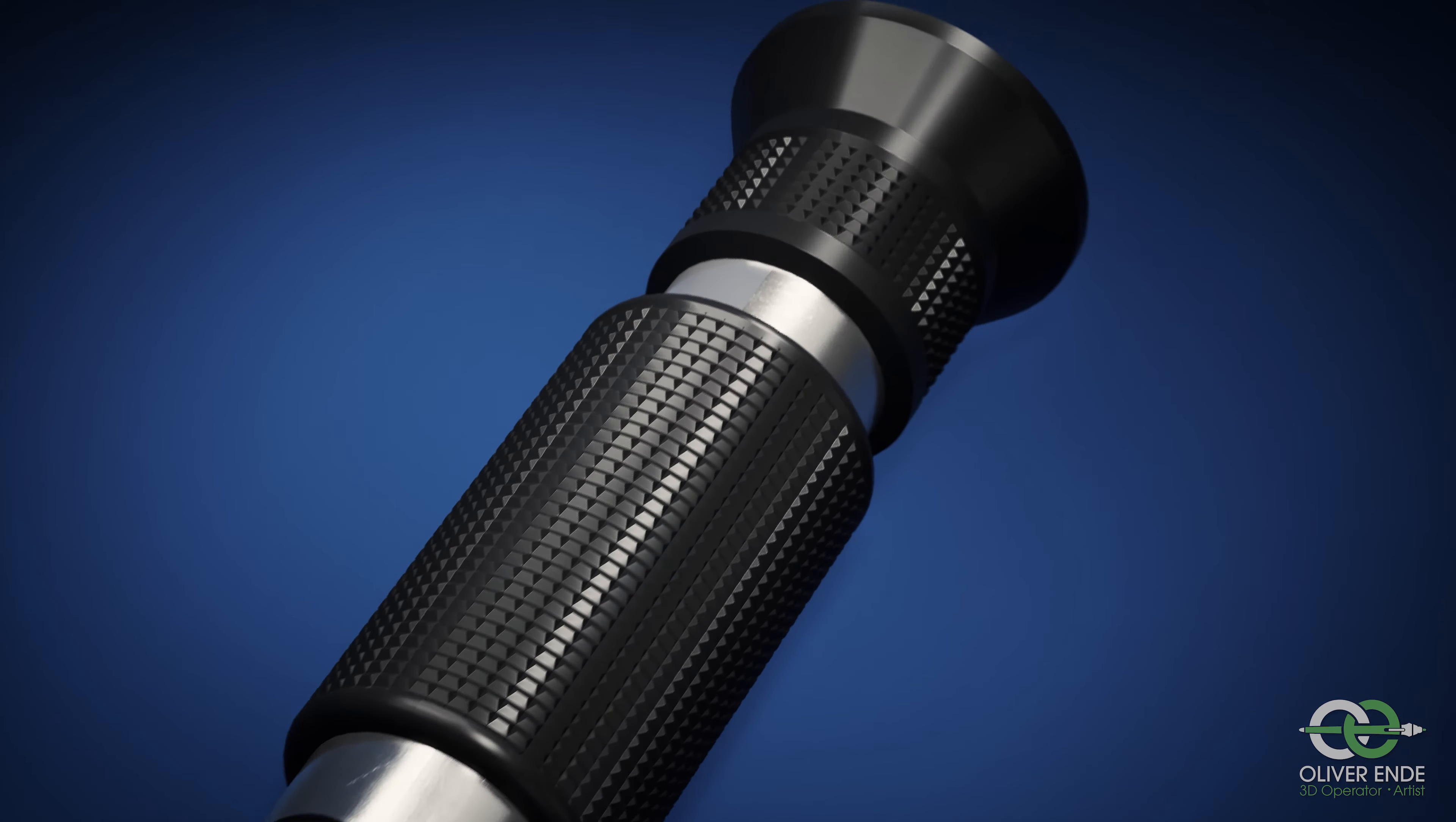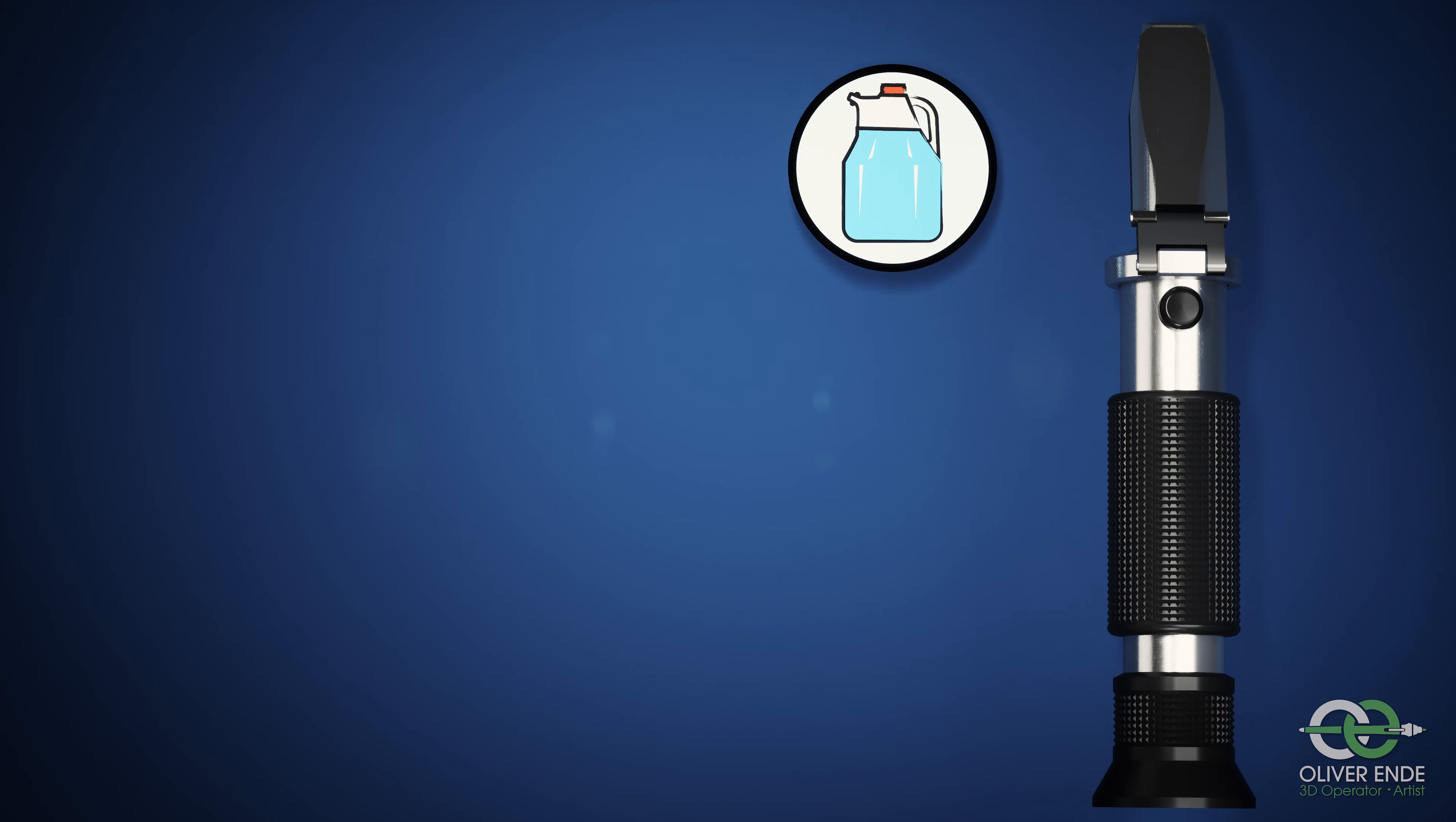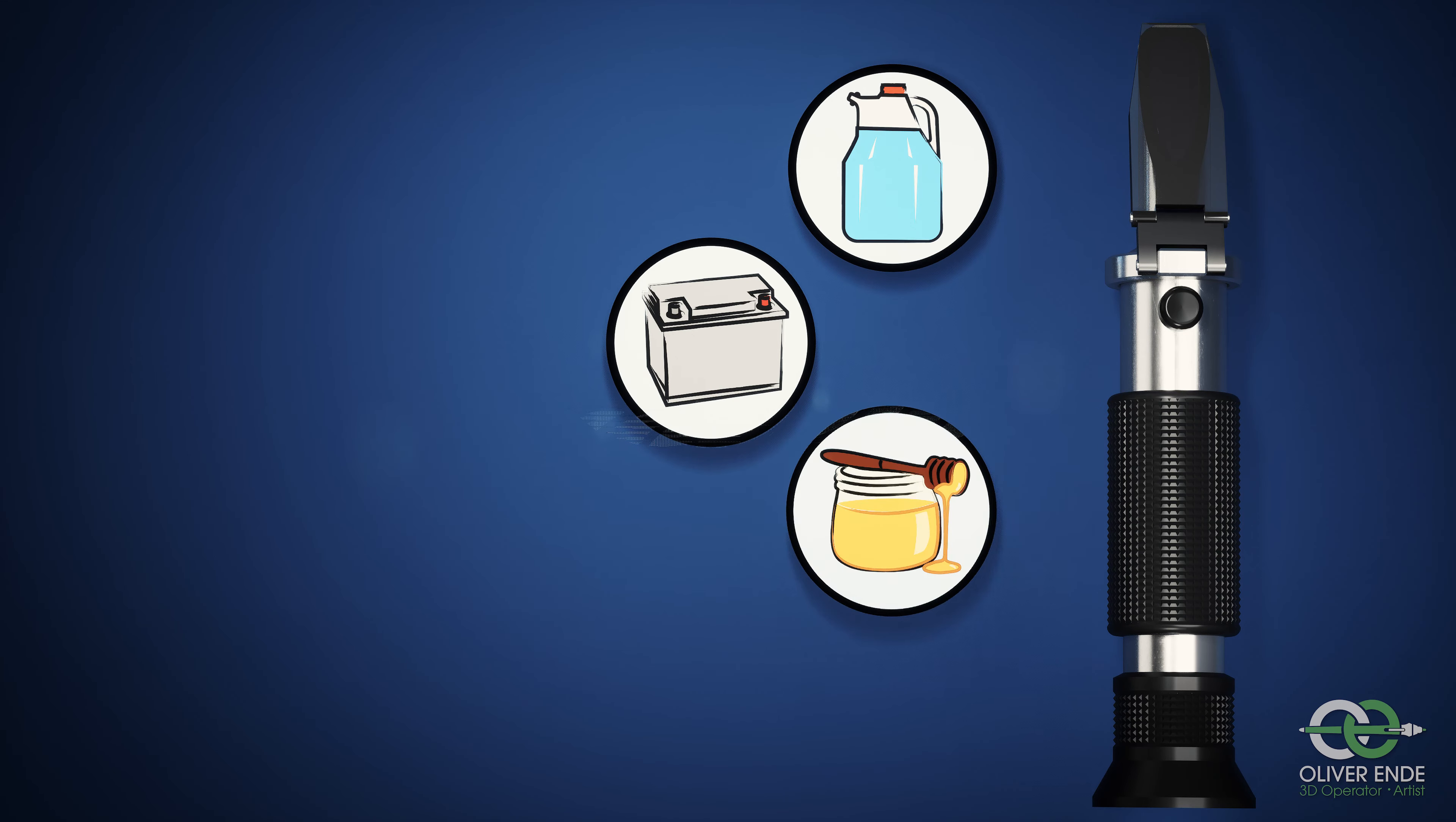It is used in various fields depending on the model. For example, it is used to measure the freezing point of antifreeze, to analyze the electrolytes in a car battery, to determine the percentage water content in honey, or to measure the sugar content of grape juice.